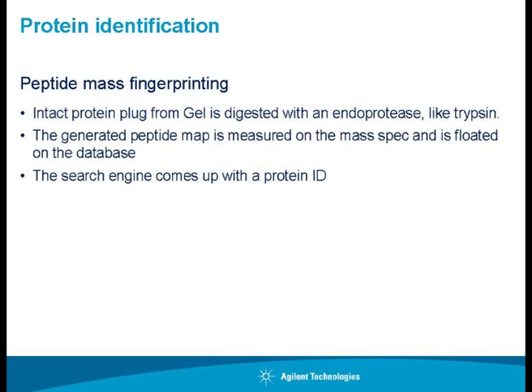For protein identification, typically what we follow is the bottom up approach. Peptide mass fingerprinting: you digest a protein with some protease, you get small peptides, you trigger an MSMS of the small peptides, again fragmenting it. So you've broken down the protein into small pieces, collate it together and submit it, so bottom up. You are taking everything together and then submitting it to a database, and then you get the identity. You started with some mass number, you fragmented that into another group of mass numbers, you submit it to a database and get a name, what exactly it is.